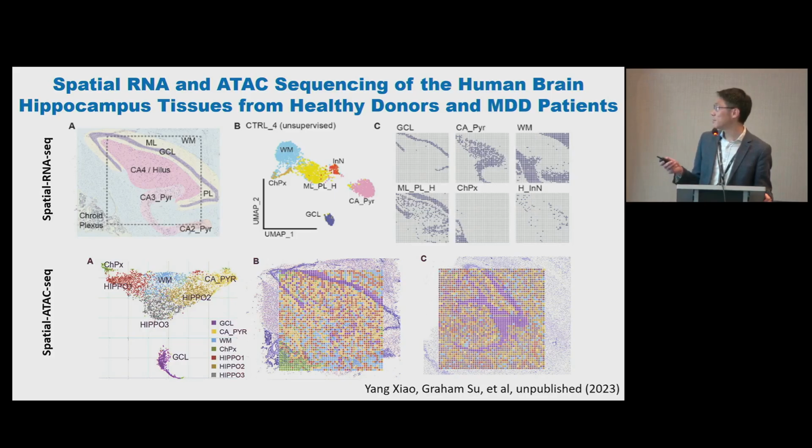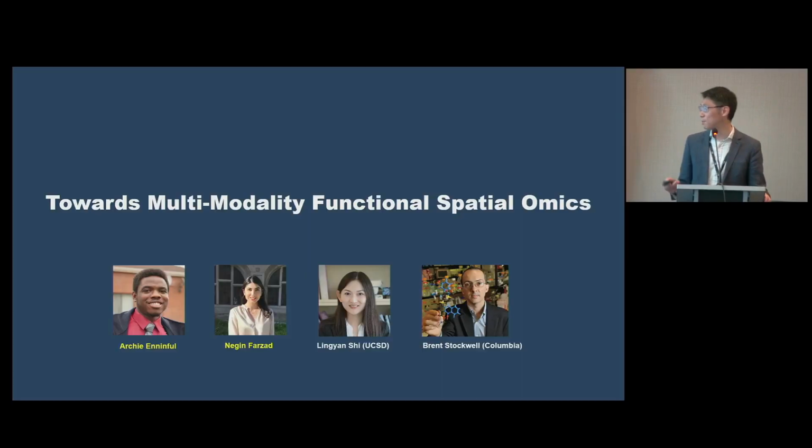All right, so now, as I said, from the same tissue serial sections we were able to generate spatial transcriptome, shown on the top panel, and spatial epigenome data. Now we try to integrate everything together. I believe that's going to give you a much more complete story. Anything else we should incorporate? I believe the functions, right?